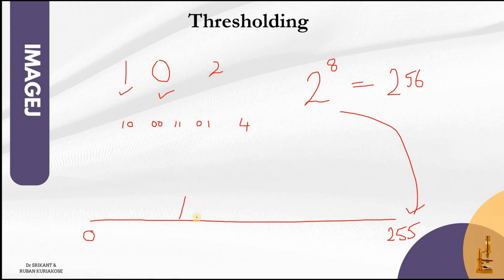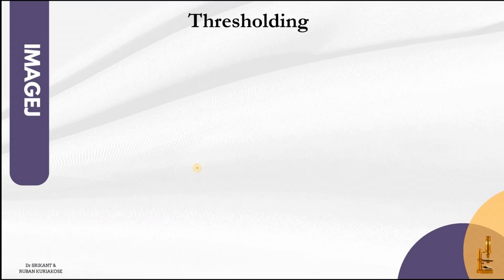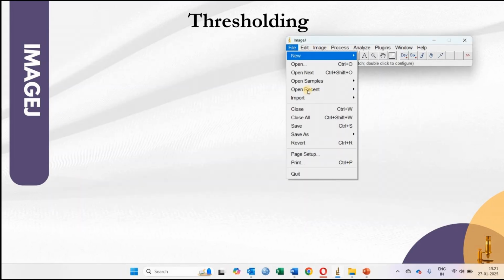And the number of particles at each single threshold value gives you a region of interest like this. Now, in this case, we have an image which is color in nature, and we will open that particular image and have a look at the threshold and the concept of colors that we use.